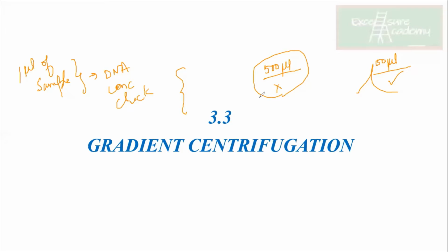Ma'am, will it dissolve the DNA? It should, right? It should be soluble in the buffer. तभी तो मैं आगे काम कर पाऊंगी, right? So what you get at the end is the DNA precipitate, because alcohol, it is not soluble, right? Alcohol क्या करता है? It is a dehydrating reagent, right? What is the chemical nature? What is the property of alcohol? That it dehydrates. So you get a DNA precipitate at the end.